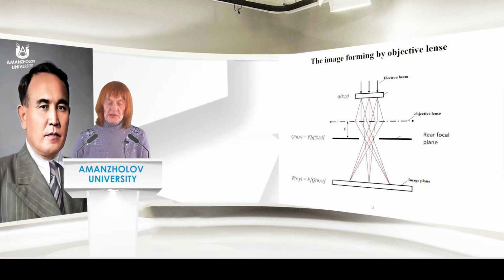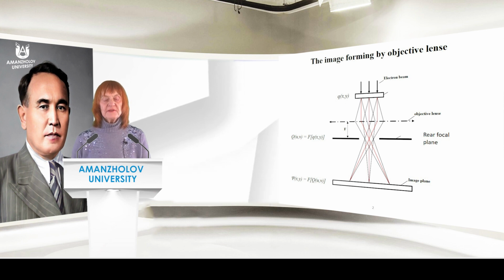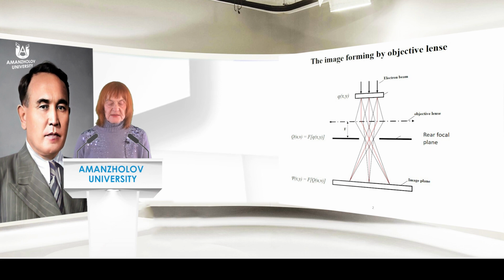Nevertheless, there is a so-called aperture shift method, including the low-angle electron diffraction method, in which magnetic domains are directly observed instead of the domain walls.